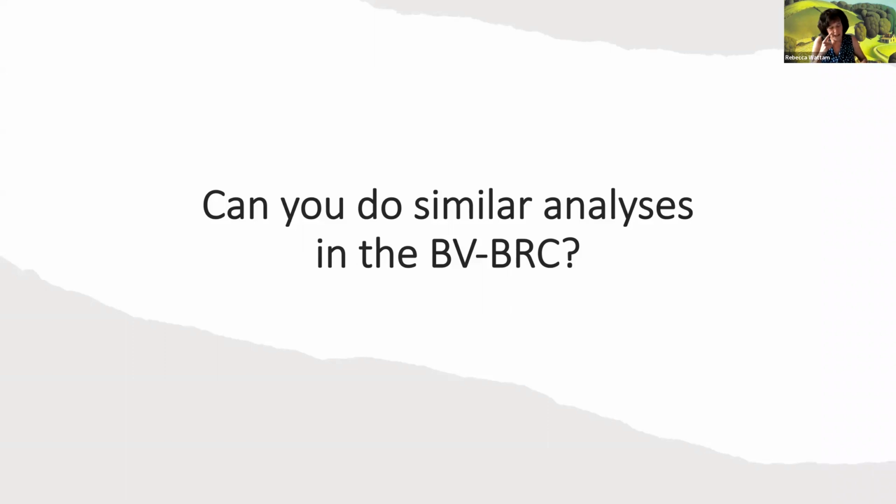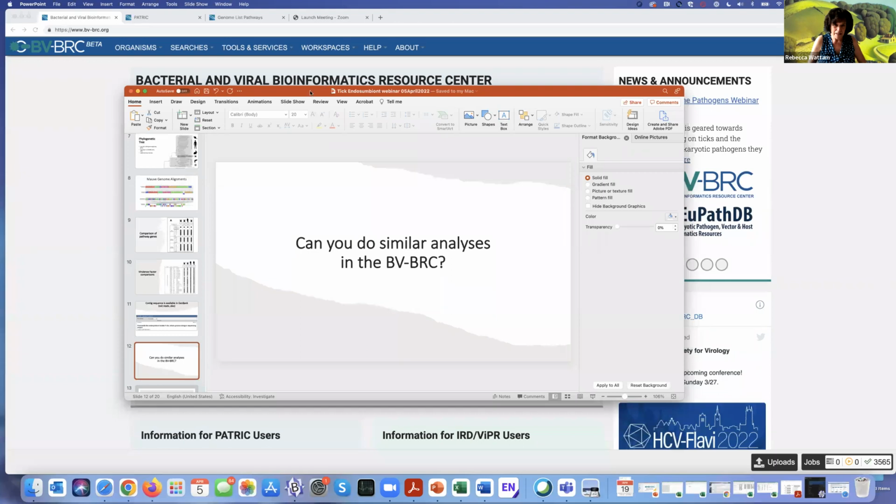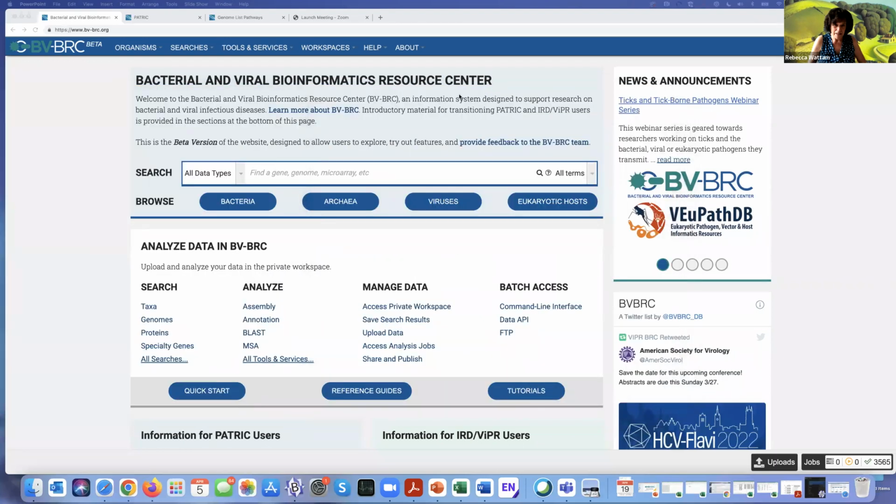And could you do it in the BV-BRC? Well, let's step away from here and go over to the BV-BRC. Oops, let me pull that guy out of the way. And let's look to see if you can do a similar analysis.